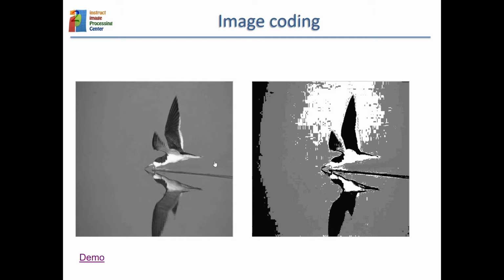So that means you need only 4 bits to represent those colors. So your colors go from 0 to 15, and if you take 2 frames of that type, each one of them having numbers between 0 and 15, and you add them, then you need a 5th bit for storing that result.